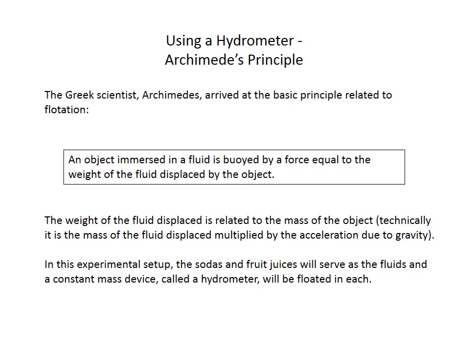If you're a physics type person, weight and mass and all this kind of stuff mean things to you. What it means here is basically you have to have as much weight pushing up as you have dragged down. And you get more weight, the more displacement you get inside there. And so the weight of the fluid is related to the mass of the object. And so you can actually figure out something about how dense a fluid is by how much it will lift something up in that process. And a hydrometer is a device that does that.